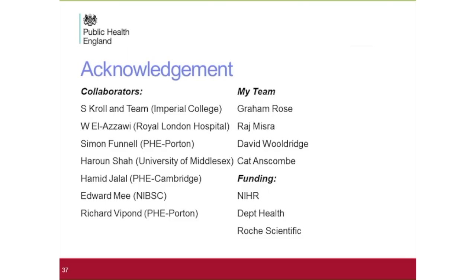So one of the criteria we've done is we had a minimum set of length reads, consecutive reads, and these were cleared using the QC criteria that I've shown on the informatics slides before we can analyze and compare those to each other.